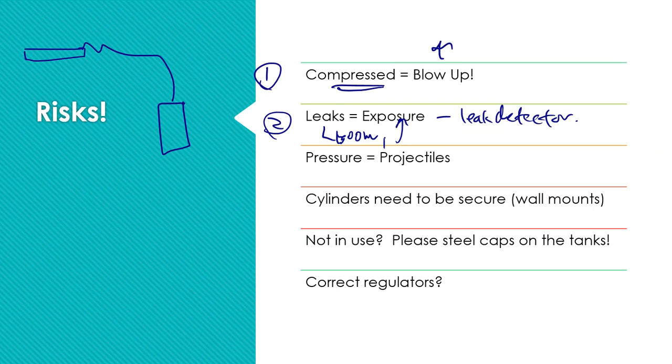Next up are pressures, and pressures create projectiles. Pew, pew, pew. Right? I don't want to start shooting stuff halfway across the room just because I build up too much pressure and stuff shoots out of wherever that gas was located. It could injure someone, it could injure me, and again, my coworkers would not be very happy if I slept on the job and wasn't constantly monitoring the pressures of these systems that I'm responsible for.